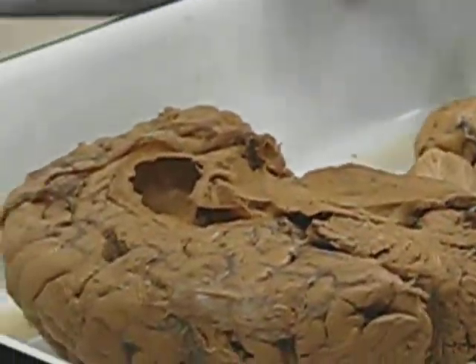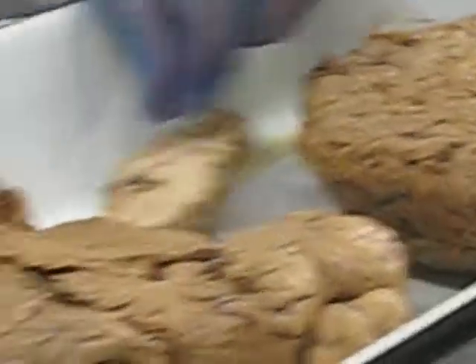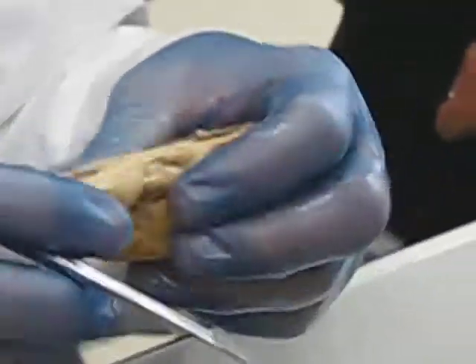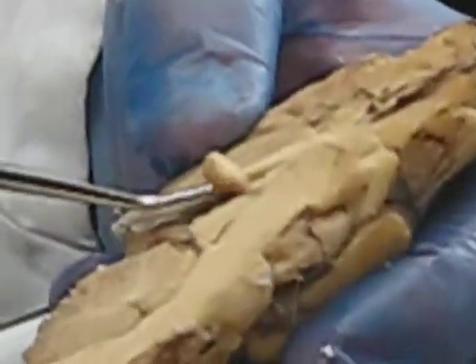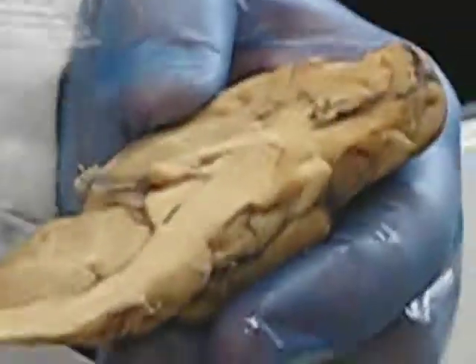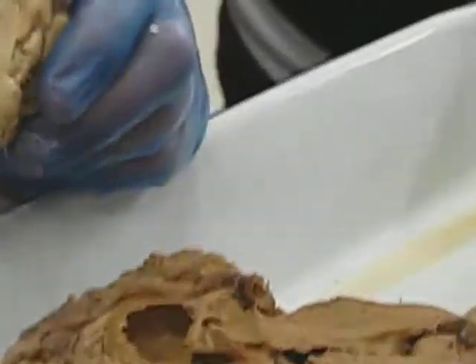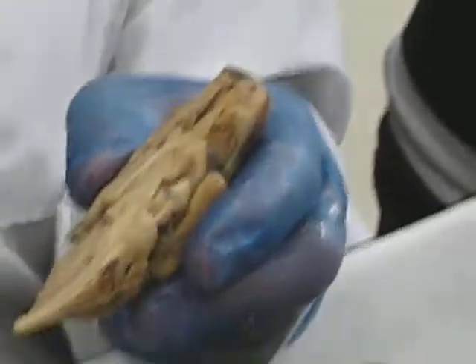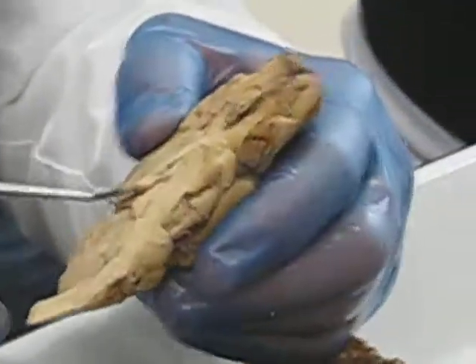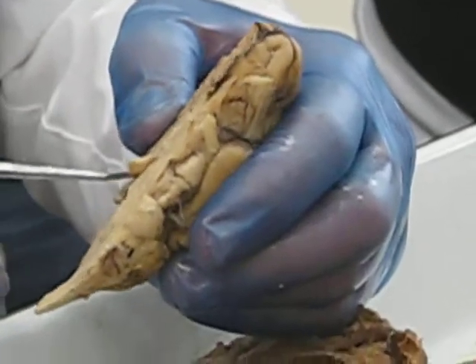The pineal gland. It's missing from these human brains, but it's present here. You can see it right there. Pineal gland right there. Can you see it on these brains? If I peeled it back, yeah. What I have to do is take off the dura mater and then bend the cerebellum forward, and I'd see them. See it right down in there. Right there is the pineal gland.